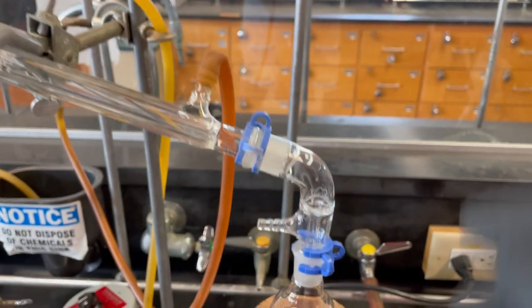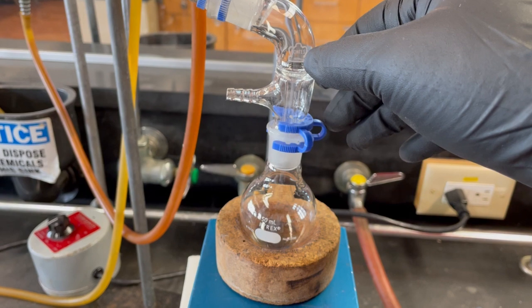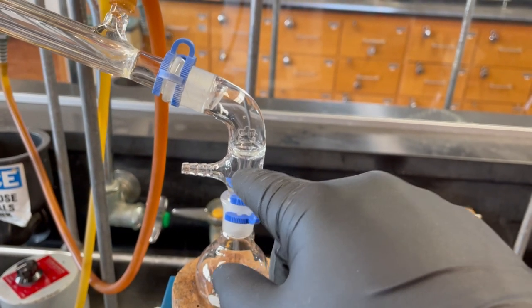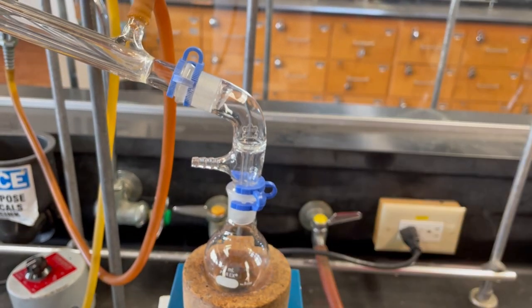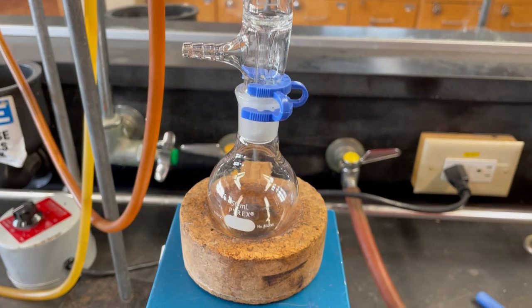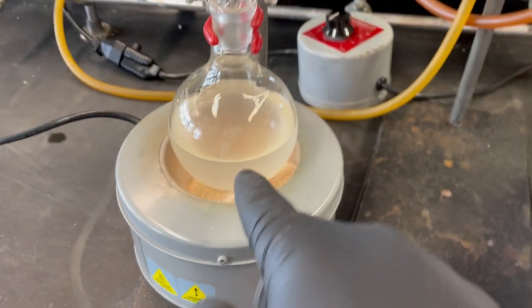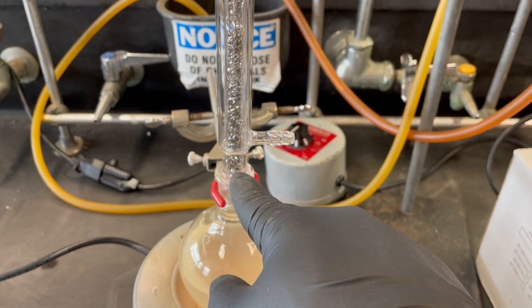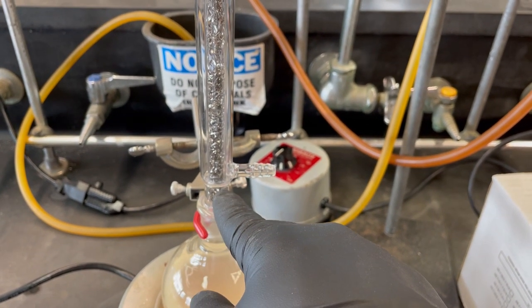Got that slow flow. And then this is attached to this adapter here, and it's a vacuum. It's got a little vacuum thing here, but we don't need to pull a vacuum on this. We're just gonna run it at standard pressure, atmospheric pressure. And then once this heats up, goes into the vapor phase, it's gonna hit some of this stainless steel sponge, and then it's going to condense to a liquid.